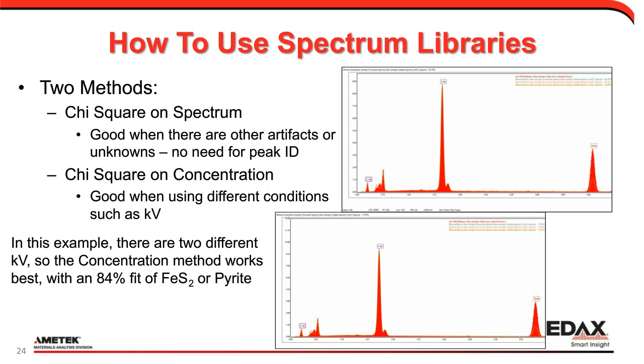Would there be extra components? You would need an EBSD camera and the EBSD software, and that's an easy enough addition to most all of our systems.